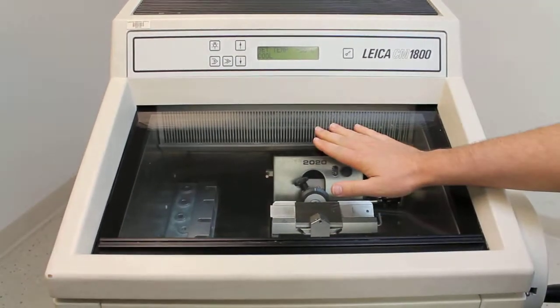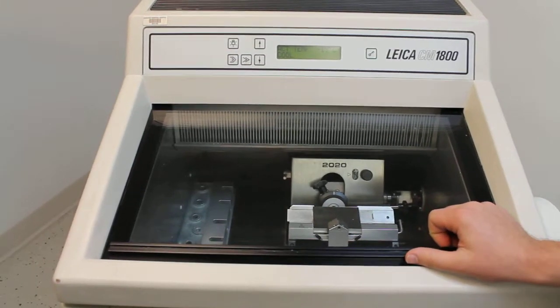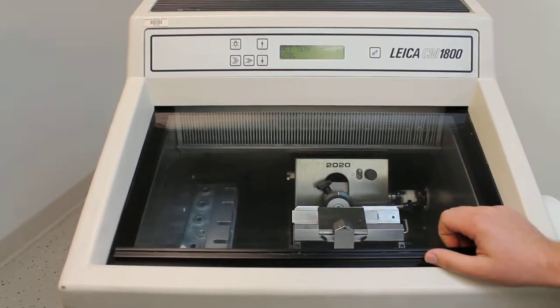We also have the heated lid. That keeps fog from forming, which allows you to see the sample you're cutting while keeping the air in.